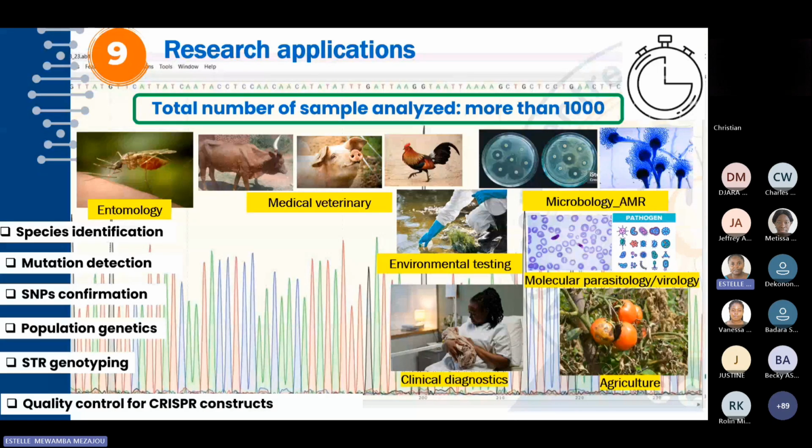And even in clinical biology for the molecular diagnostics of specific diseases affecting humans, mothers and children, as well as in agriculture to detect diseases infecting plants, or to discover new variants of species that are being raised.